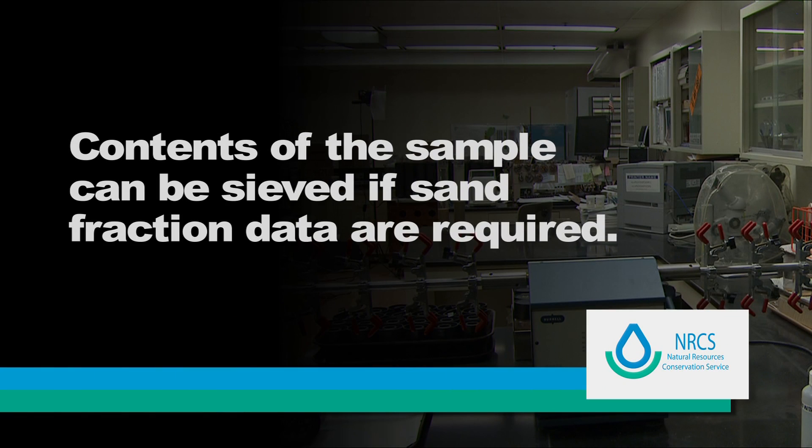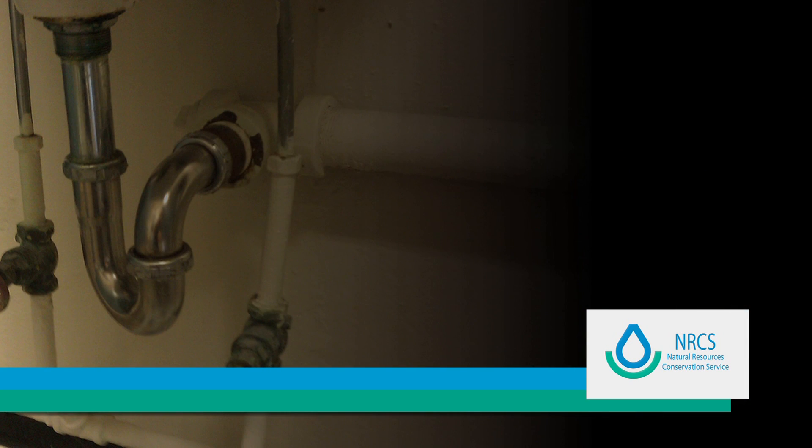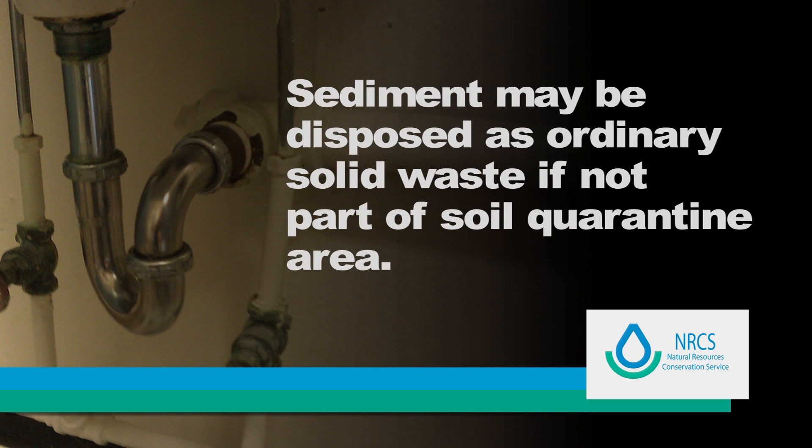After completion of hydrometer readings, the contents of the cylinder can be sieved if sand fraction data are required. Pouring the cylinder contents down the drain may accumulate sediment in the plumbing. To avoid this, pour the mixture into a bucket or similar container and allow the soil to settle. Decant the liquid portion and chase with copious tap water. The sediment in the bucket may then be disposed as ordinary solid waste, if not part of a soil quarantine area.